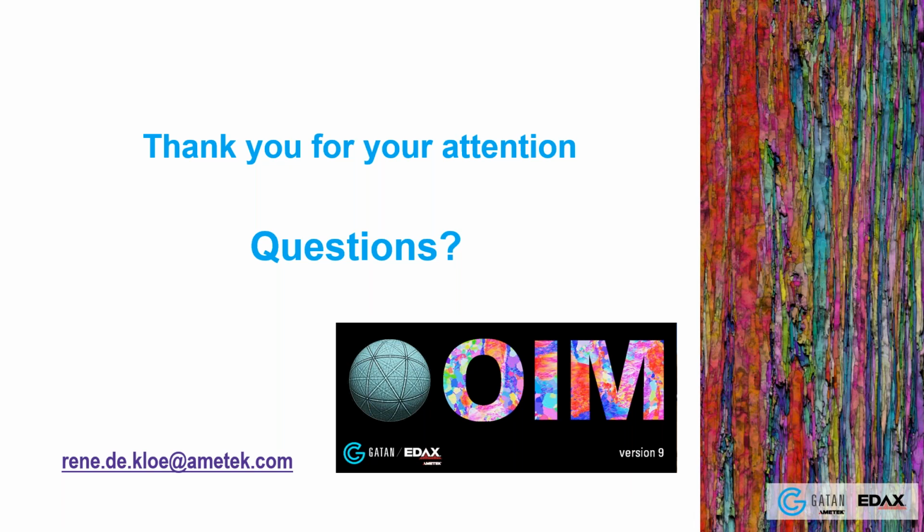Another question, for good re-indexing, would you recommend saving only the unprocessed images? Not necessarily. I like to see as good an indexing result as I can get when I collect the data. And when the patterns are already to a large extent optimized with a background, if I do it again, if I add another sequence of background processing on top of that, I see that the contrast in the pattern gets a lot better, and it allows me a little bit better to correct for any topography that I may have.